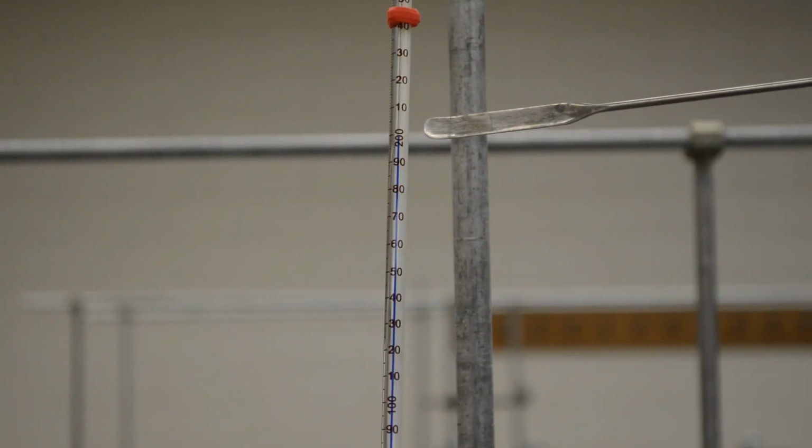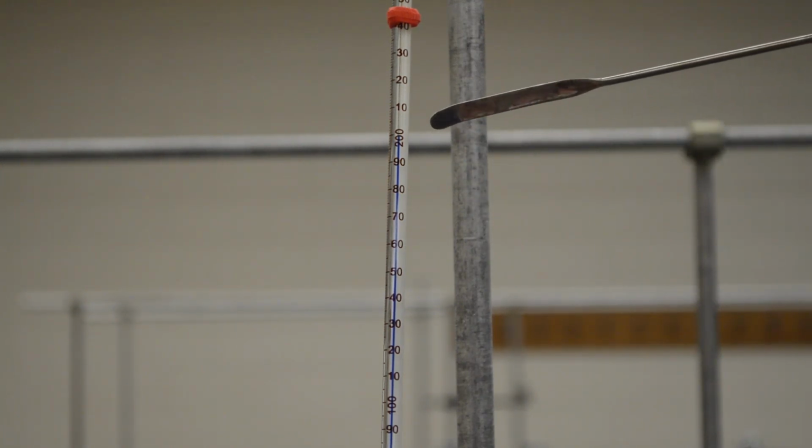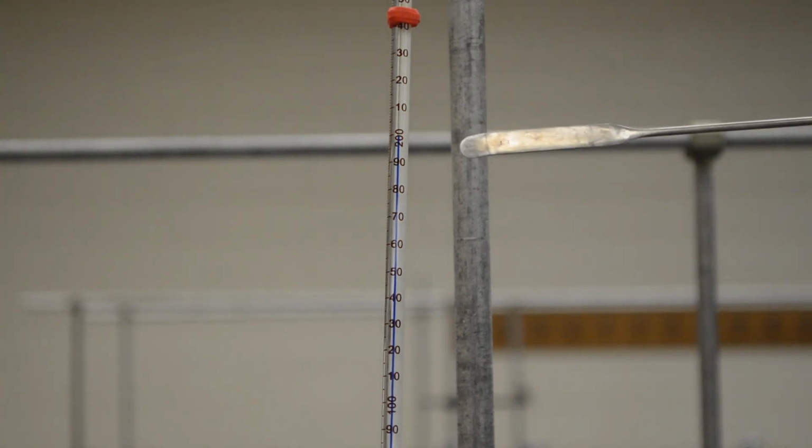Okay, that is 200 C. The temperature of the reaction is now a little below 200. That is too much for this reaction. I guess I should lower the heating.